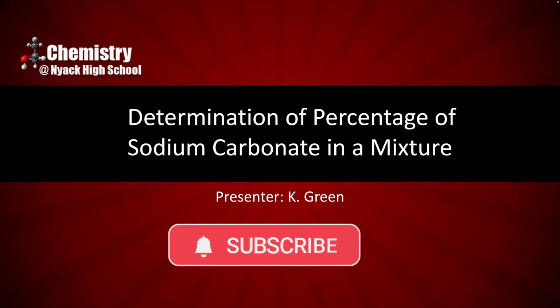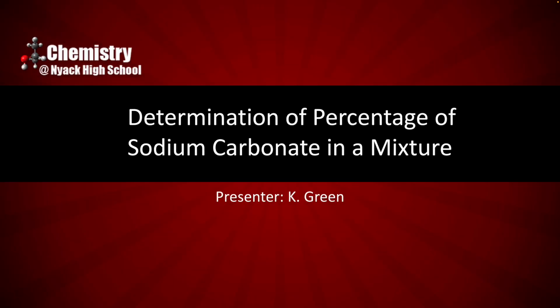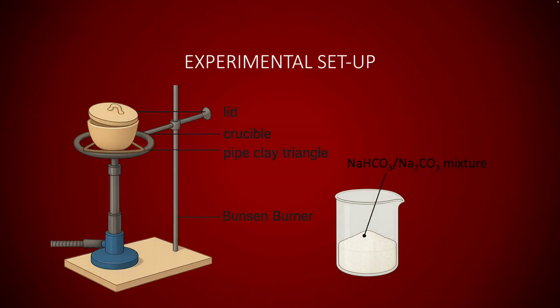The objective of the lab is to determine the percentage by mass of sodium carbonate in a mixture. The experimental setup includes the following: a crucible, a ring stand, a pipe clay triangle, a Bunsen burner, and a mixture of sodium bicarbonate and sodium carbonate.